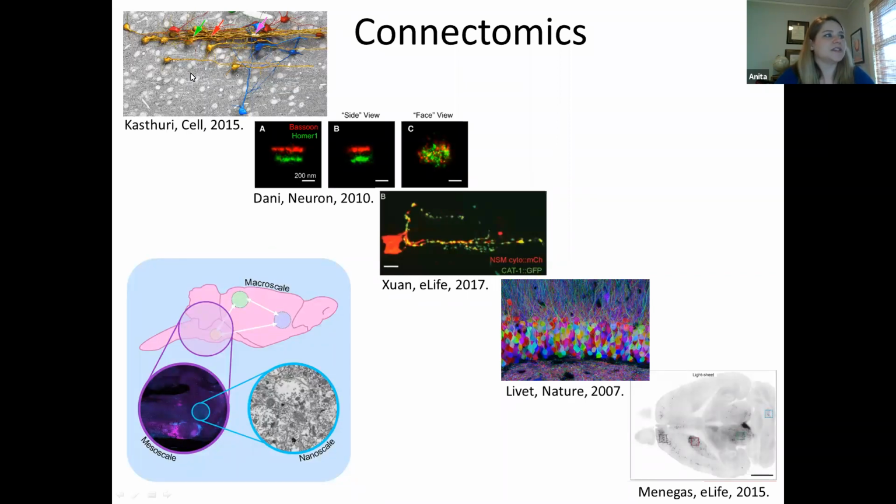And then of course they have to take all of these images and save it all, and then it gets somewhat automatically but also manually traced. So at the time that this paper came out, this was partially manual. So they just had a bunch of Harvard undergraduates tracing neurons all day.